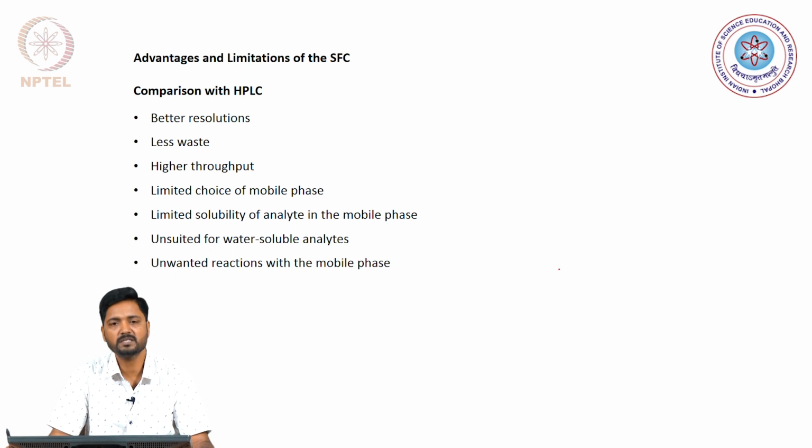Now, let us look at what are the advantages and limitations of supercritical fluid chromatography in comparison to the traditional techniques like high performance liquid chromatography and gas chromatography.